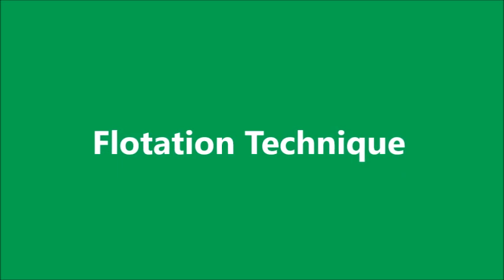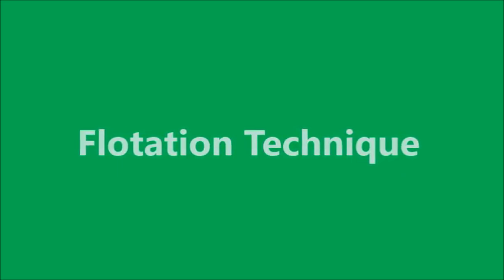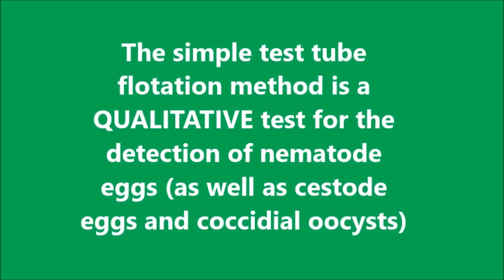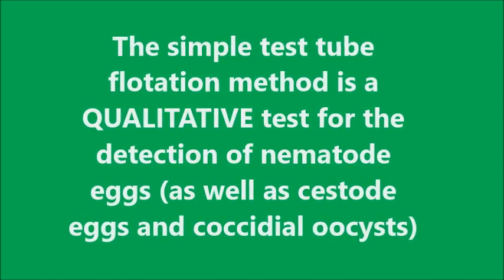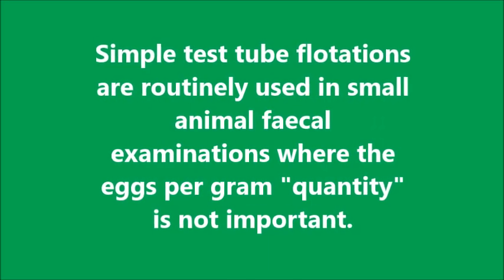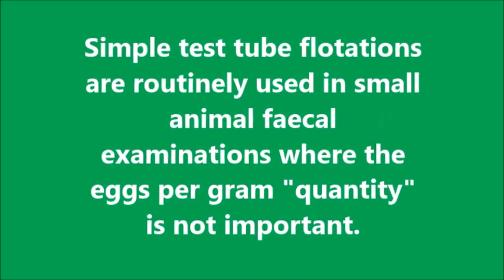The simple test tube flotation method is a qualitative test for the detection of nematode eggs, as well as cestode eggs and coccidial oocysts. Simple test tube flotations are routinely used in small animal fecal examinations, where the eggs per gram or quantity is not important.